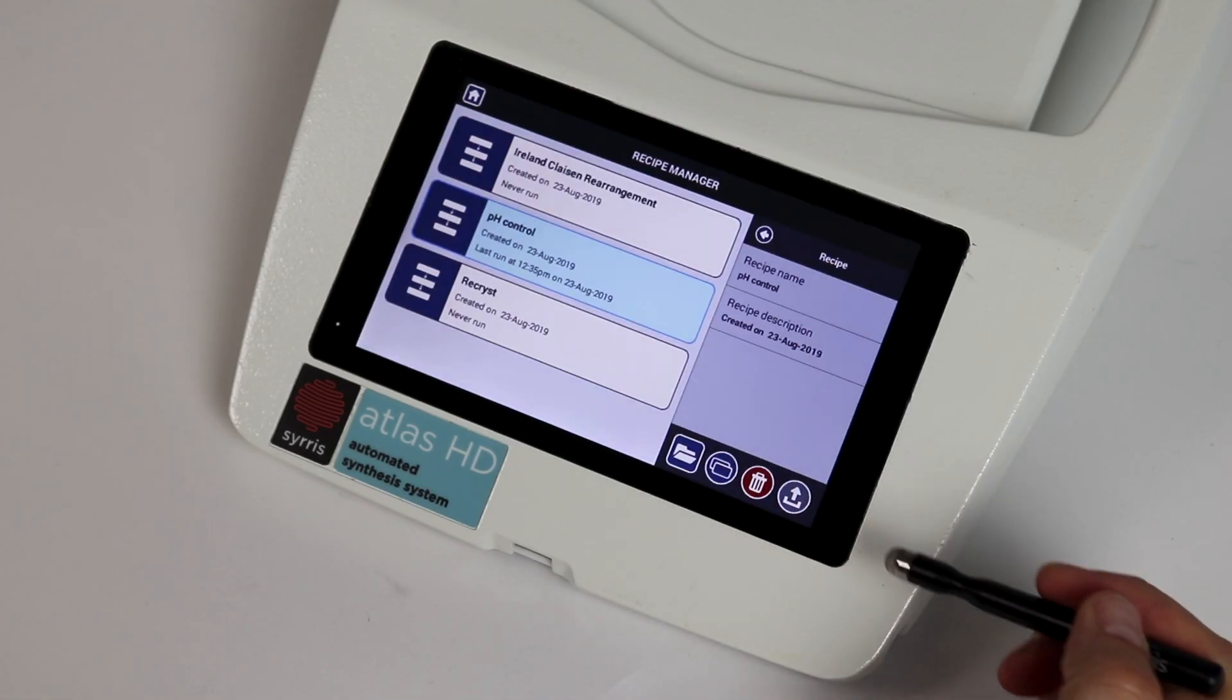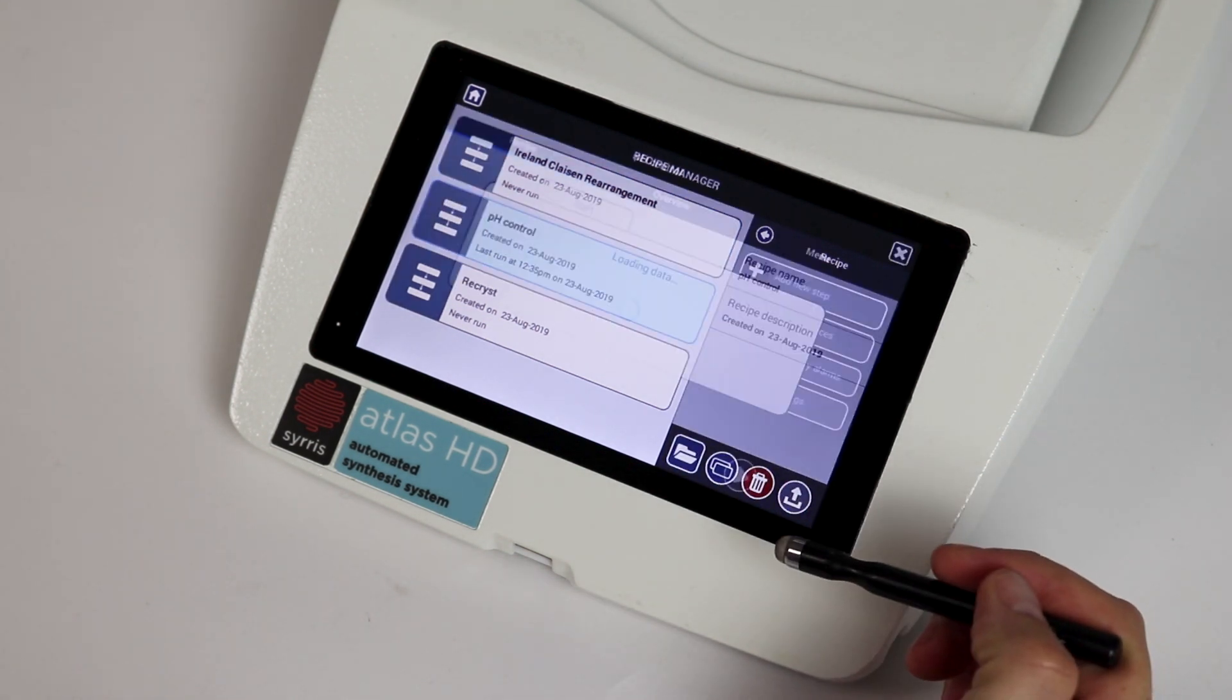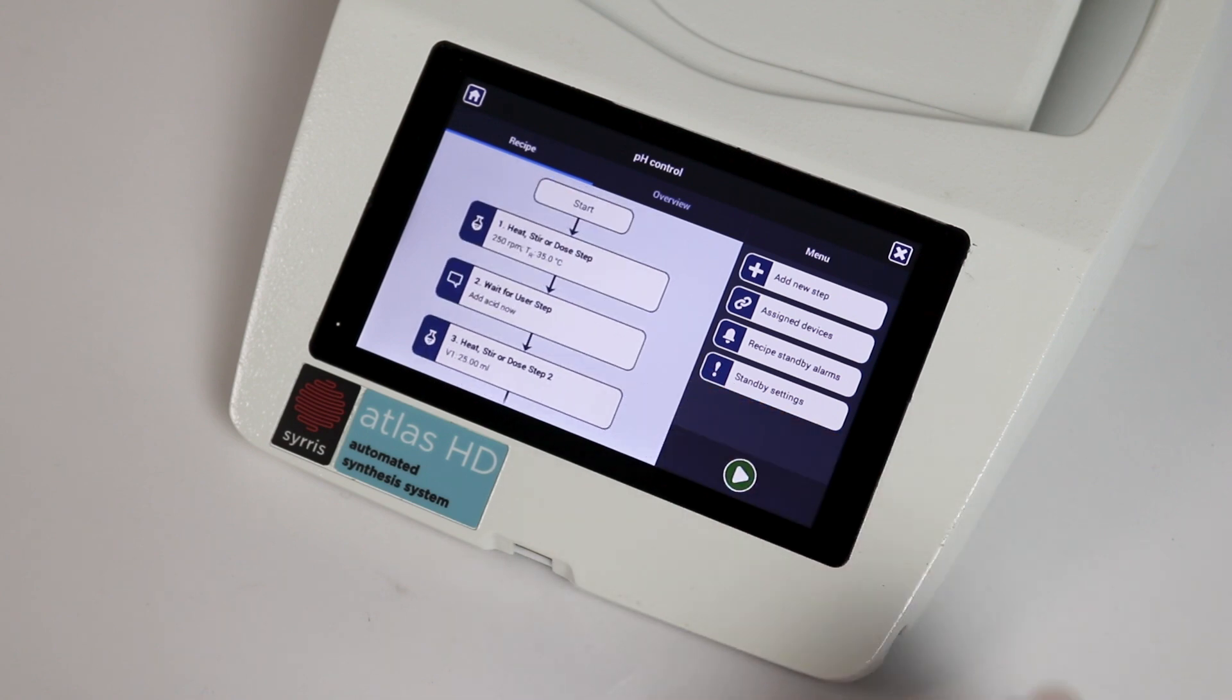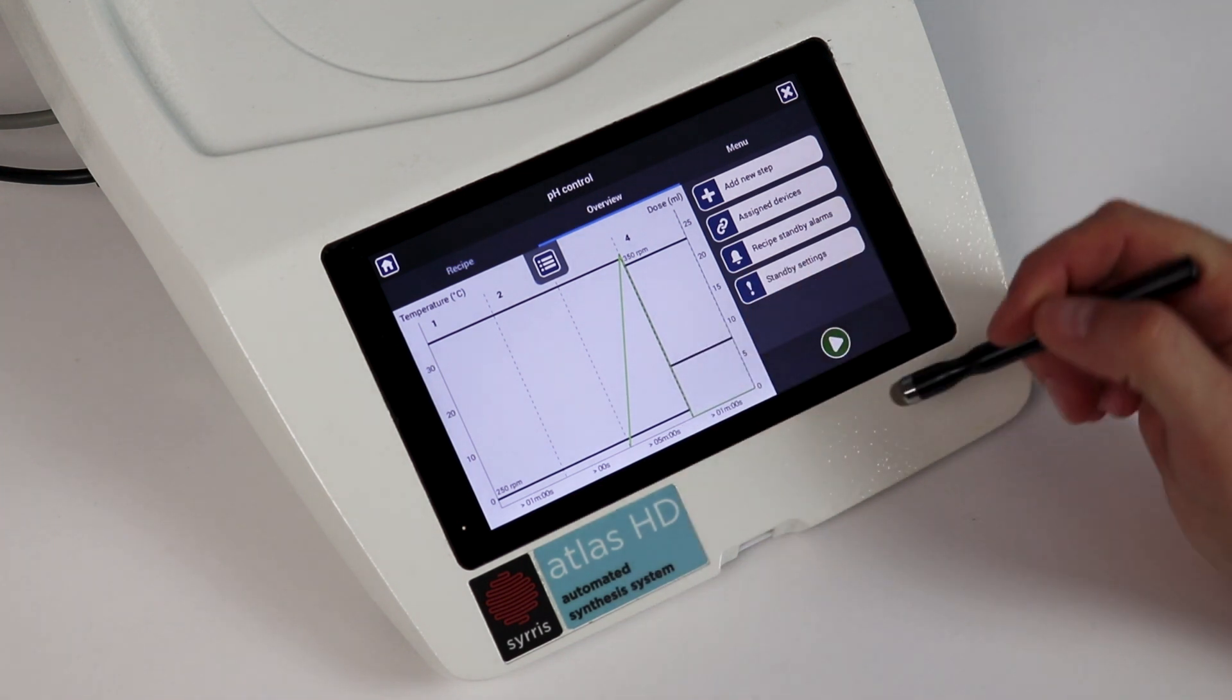Standalone automation allows users to store and control reaction protocols called recipes, which include heating, stirring, and dosing actions, ensuring your reactions are the same every time, improving batch-to-batch reproducibility and removing the need for tedious manual operations.